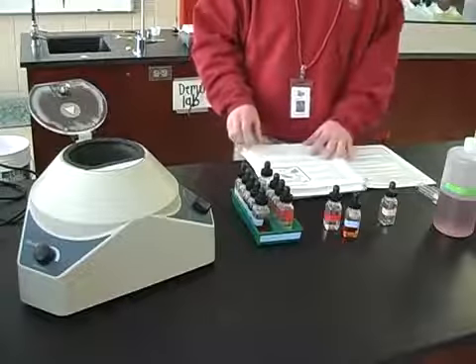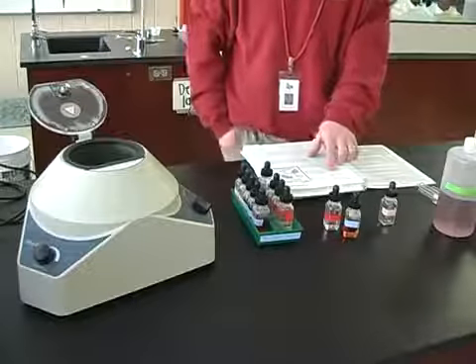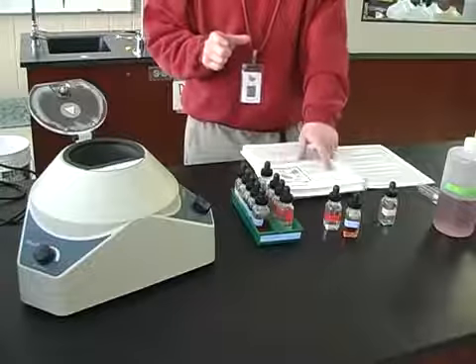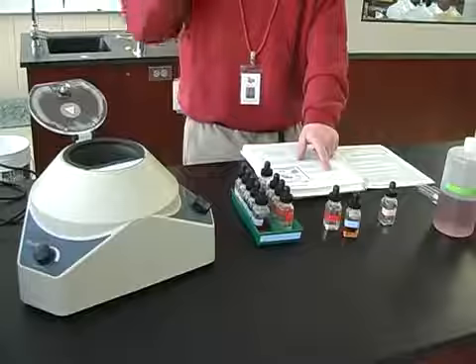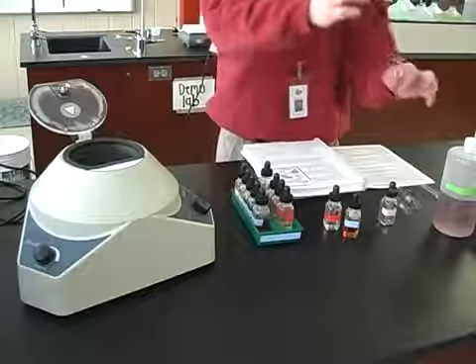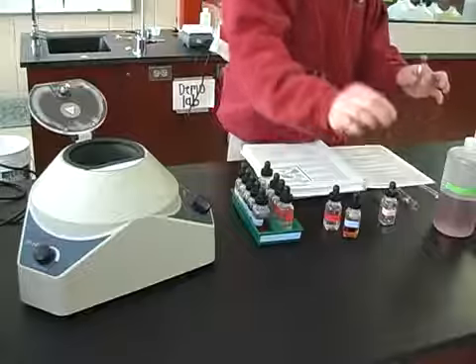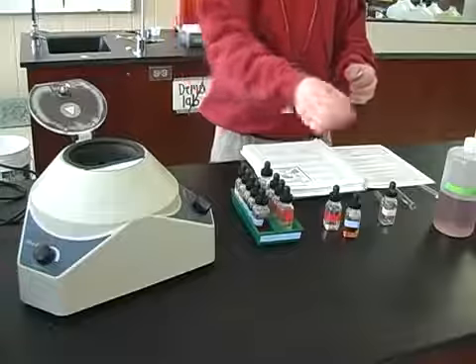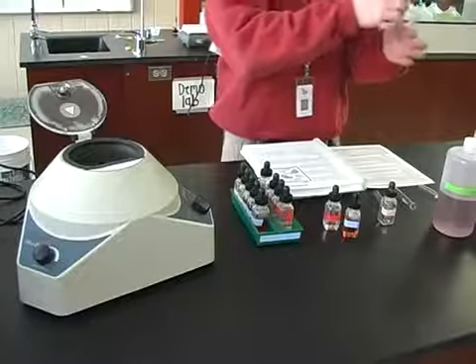Checking the pH. To check the pH of the solution, put a piece of, it says litmus paper, we have pH paper, onto a clean glass plate or a watch glass. Dip your stirring rod into your test tube, then take your stir rod out and touch it to the litmus paper, or in our case, the pH paper. Don't dip the test paper into the test tube.